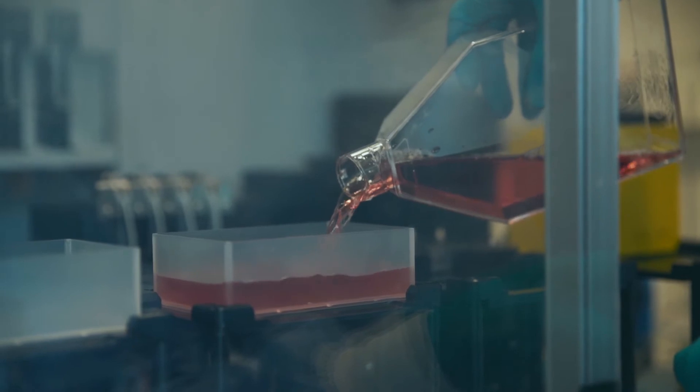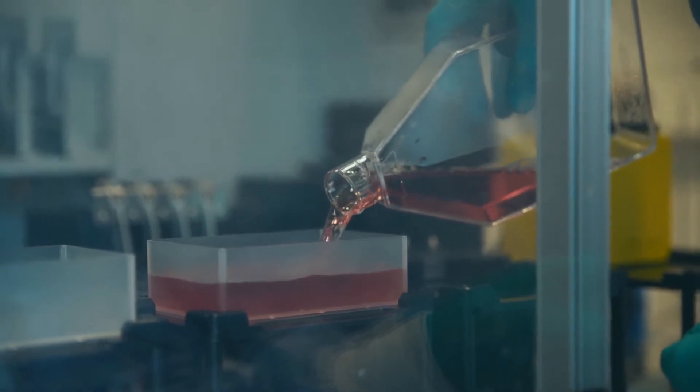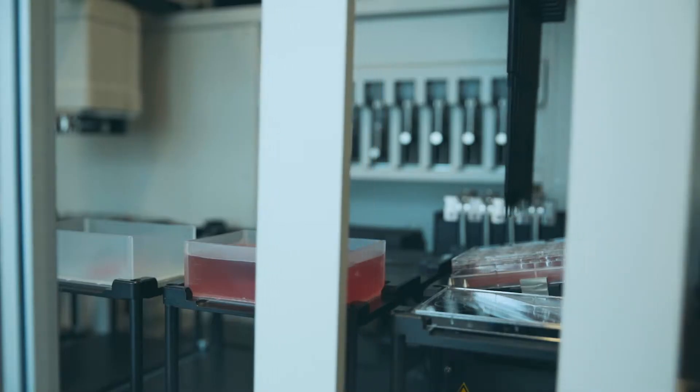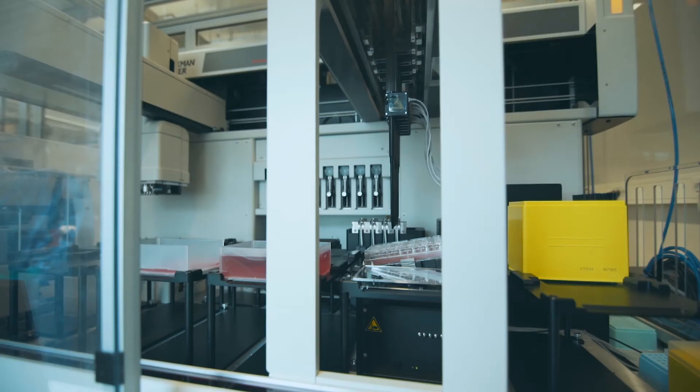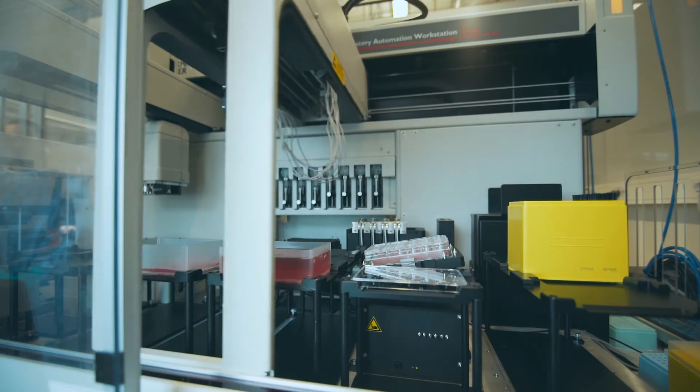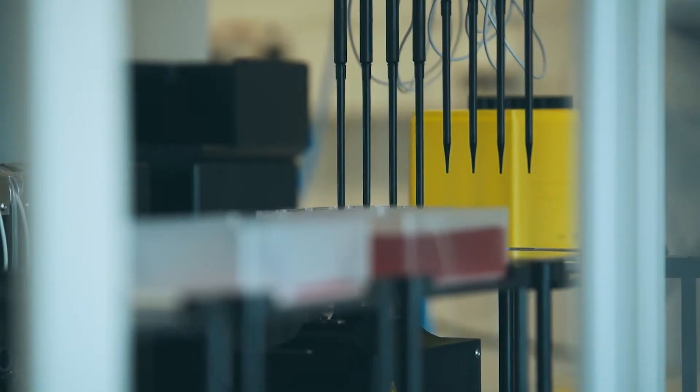Timely addition of nutrients is essential for the survival of cells. The tilting automated labware positioner on the Biomech can slant the plate so that the pipettes can exchange media without disturbing the adherent cells.